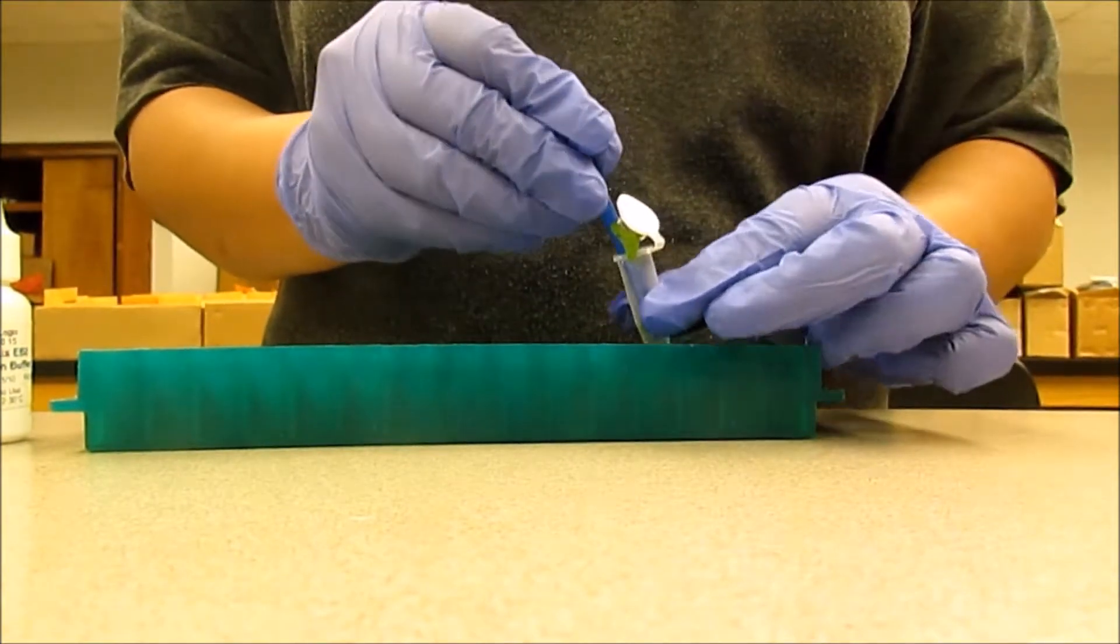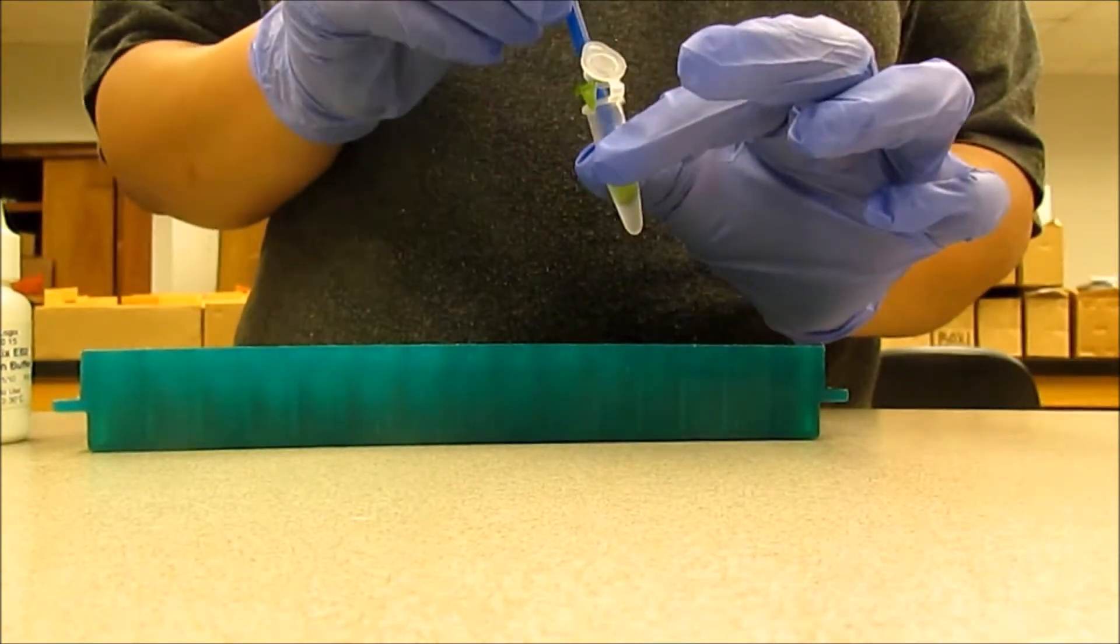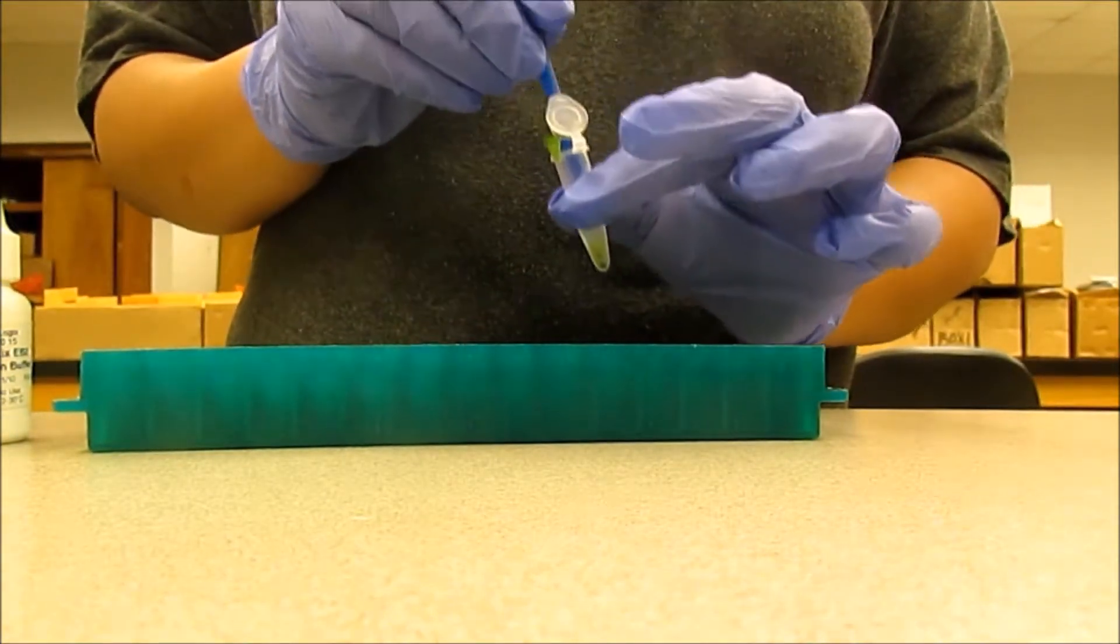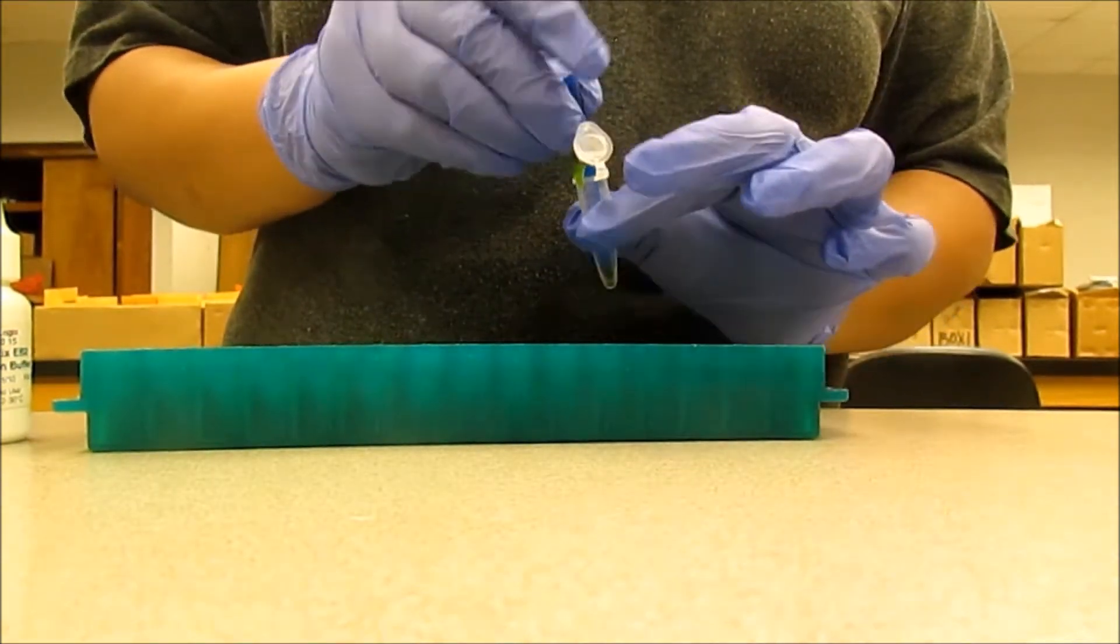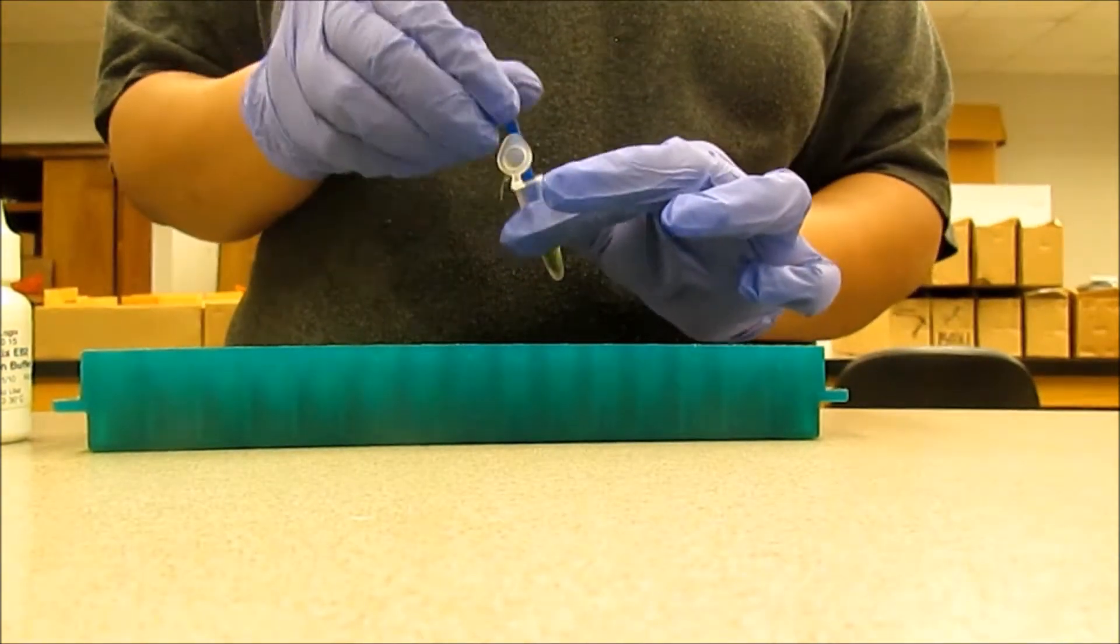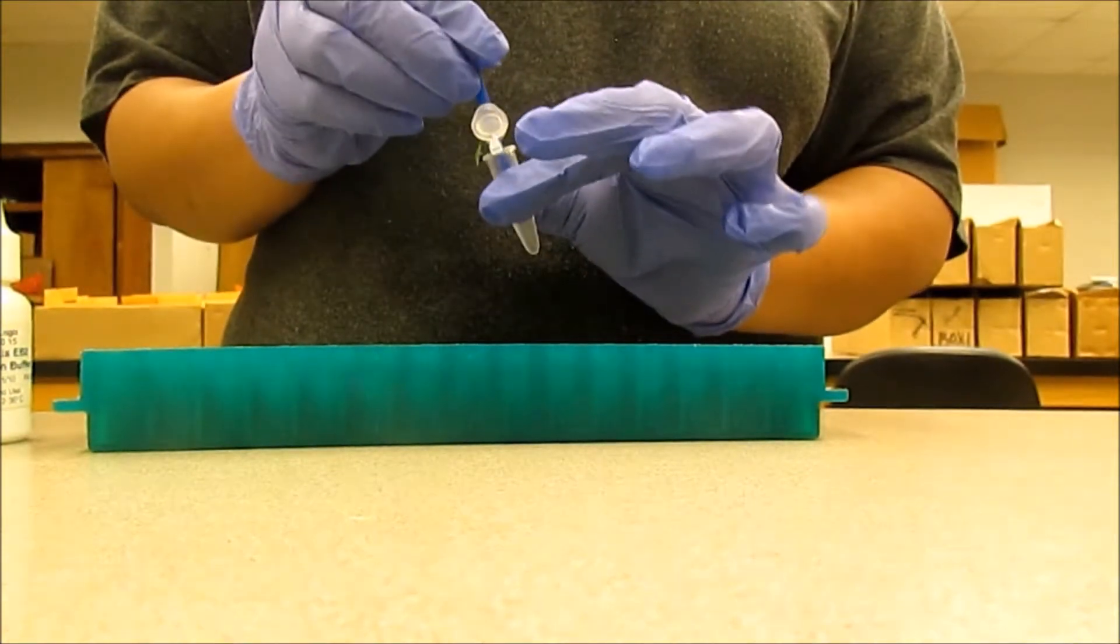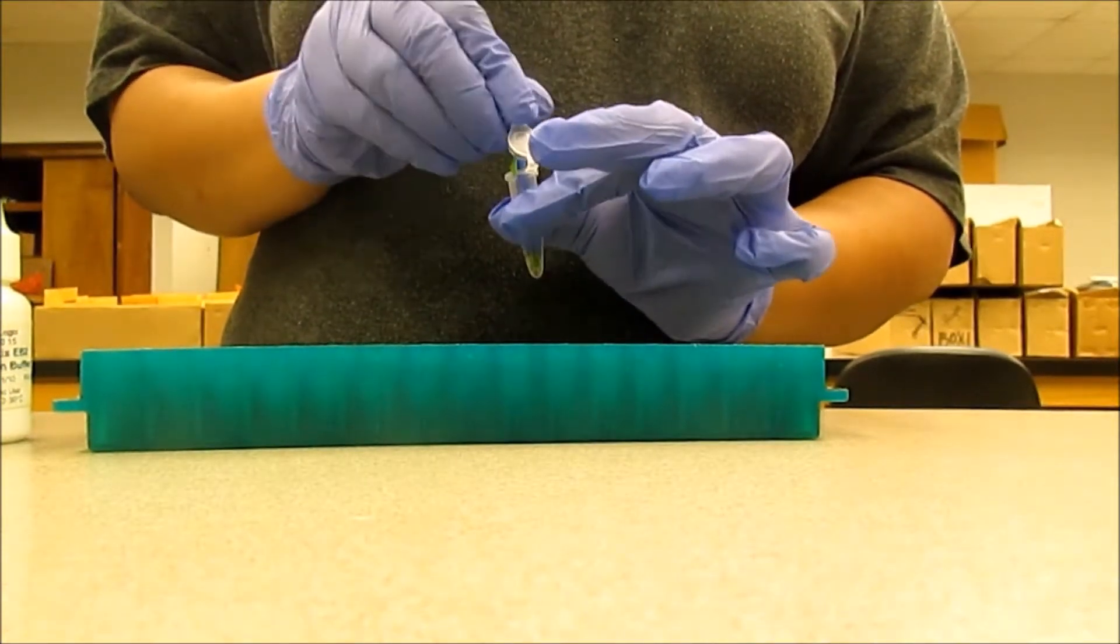After adding the buffer, we will take a pestle and grind the sample a little bit. We will take the sample into the buffer so that the proteins are extracted from the leaf. Make sure to grind the sample thoroughly.